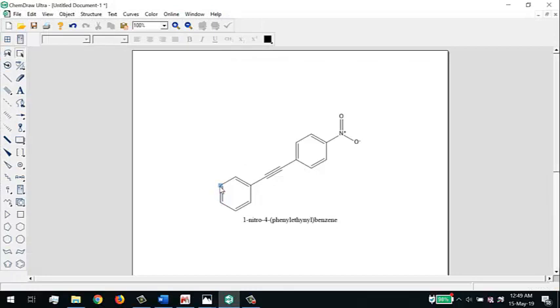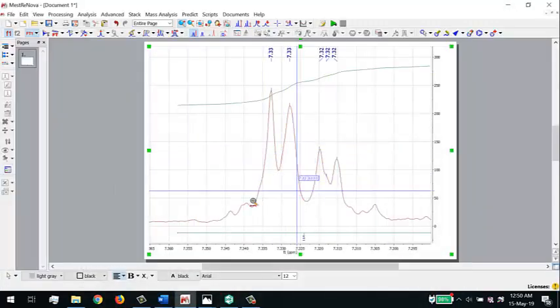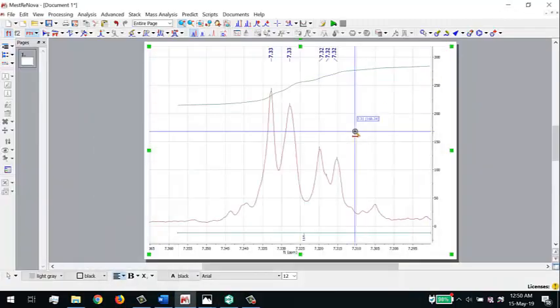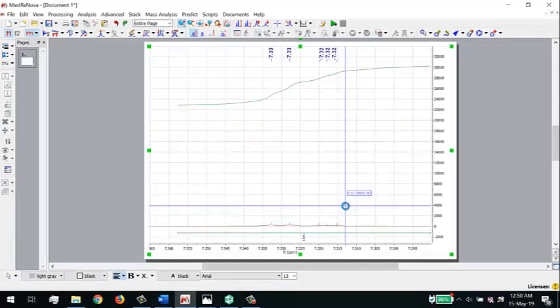So this proton is split by this proton, they're identical. Is there any splitting? It's hard to say. It's hard to say indeed, because notice that it's 1.64, which implies that this proton and this proton are bunched up together. And because this is split by this, we get a whole mess of issues when this is also split by this, and it's not a nice spectrum. It's not a nice peak to resolve. But let's assume that this is right for now.